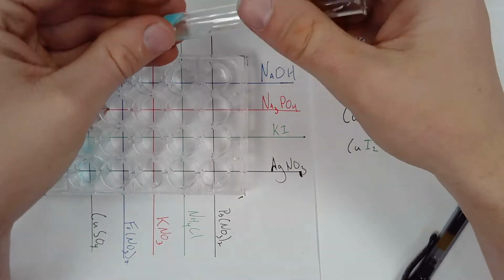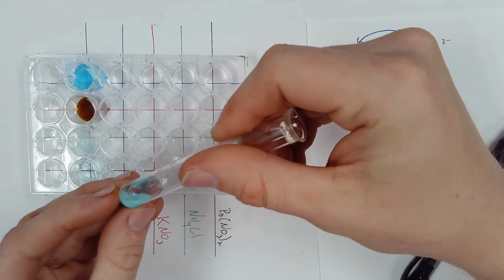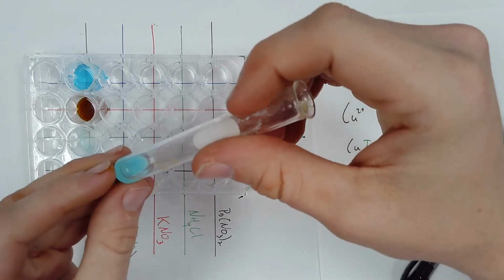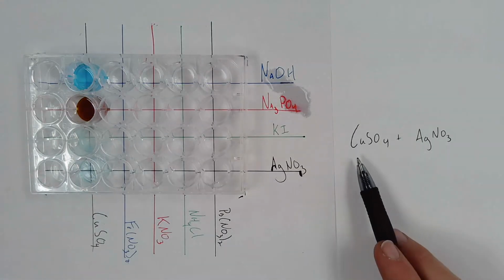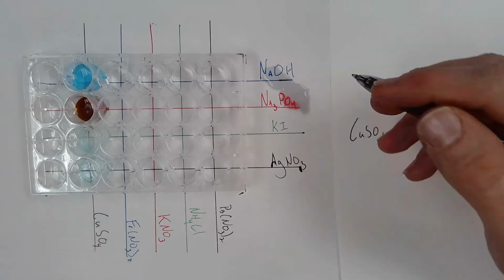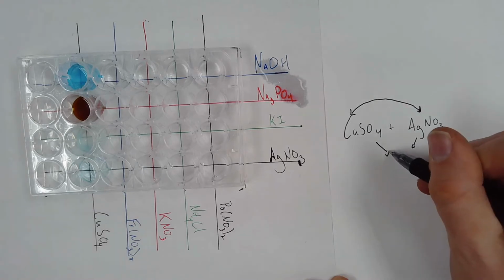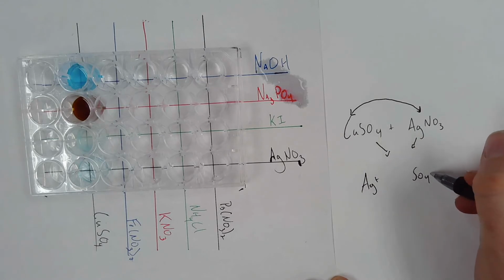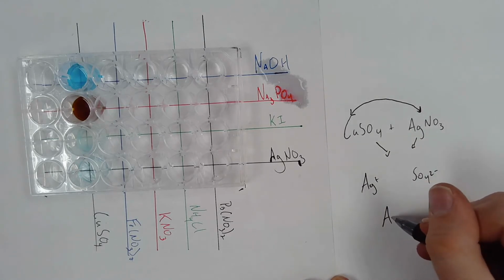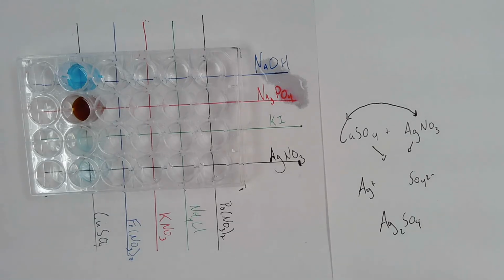There we go. So I grabbed this and I just centrifuged it, and you can see very clearly that it was in fact a solid, right? This is very clearly liquid on one side, and down here is the rest of the chemical. Now, this time, I can ignore the copper, because the copper is going to bond with a nitrate. And what do we know about all nitrates? So now the question is, does this make a solid? So I need to combine them, okay? Ag2SO4. I'll use my rules for precipitates, check that, and then let's see what happens.